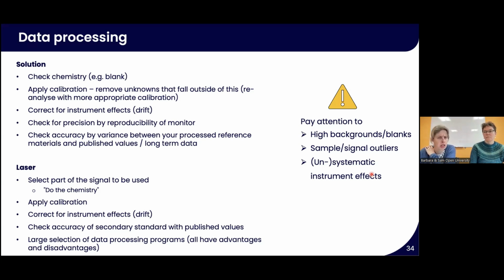And data processing for solution is, in my experience, largely done with the package that's provided by the instrument manufacturer. So we use our Agilent package that's produced in terms of the solution data processing. For laser ablation, this is a little bit different. Lots of the ICP manufacturers are getting better at including laser ablation kind of information, but this has largely not been the case. And so there are a whole range of programs out there that you can use to process your laser data. And these different programs all have advantages and disadvantages depending on which ones you pick.